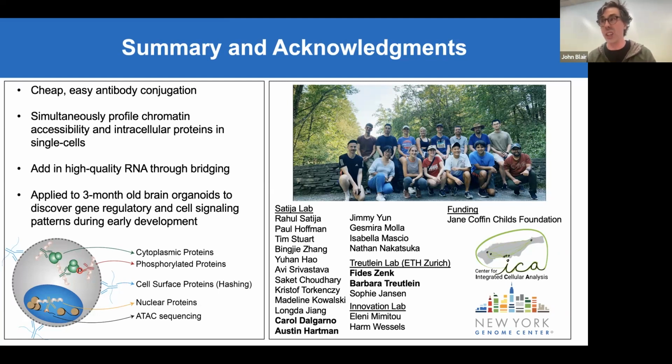But yes, we can't really take into account at this time the antibody dynamics, but as we do use more antibodies and move forward, we'll be able to pare down a list of antibodies that work really well in this assay and those that don't. And so when we have our big panel of antibodies that I used here, not every single one of them worked well. And that's a really important point.